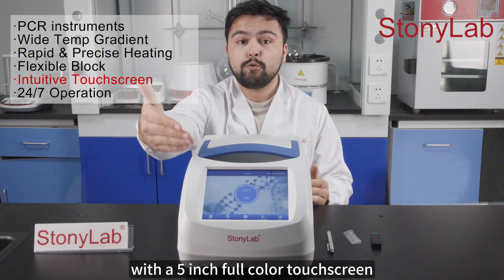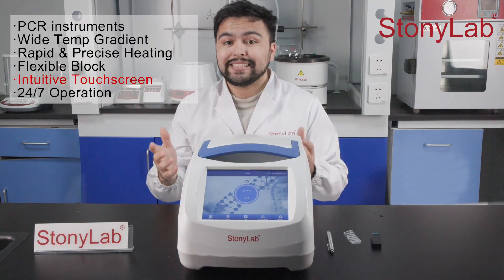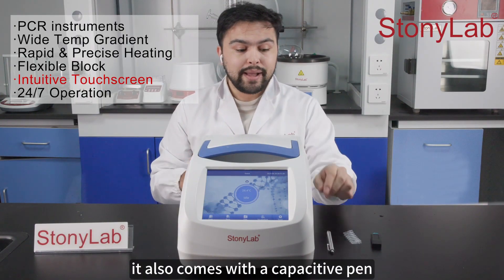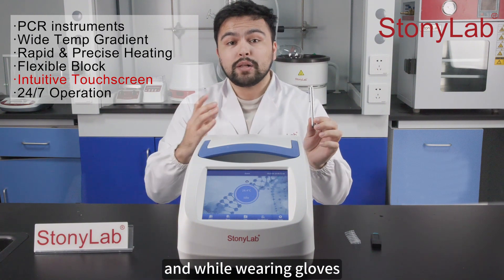The operation is simple and user-friendly, with a 5-inch full-color touchscreen allowing you to easily edit, save and run programs. It also comes with a capacitive pen, enabling precise touchscreen operation while wearing gloves.